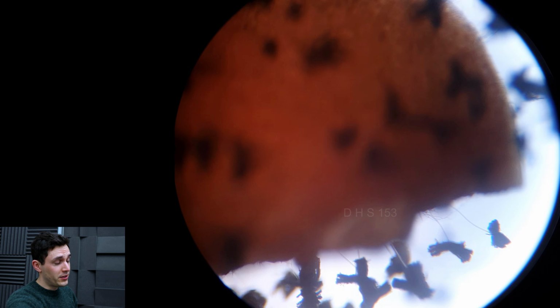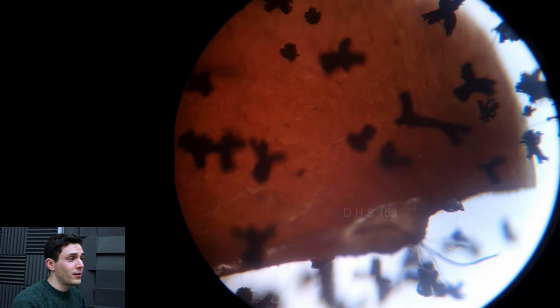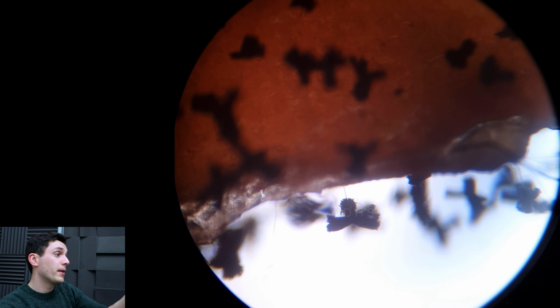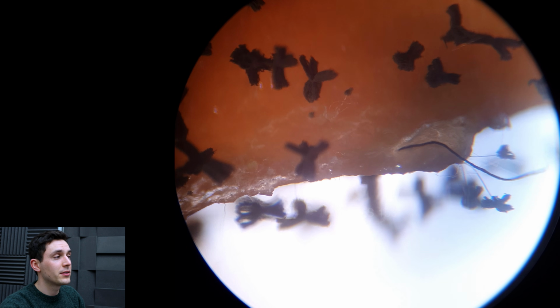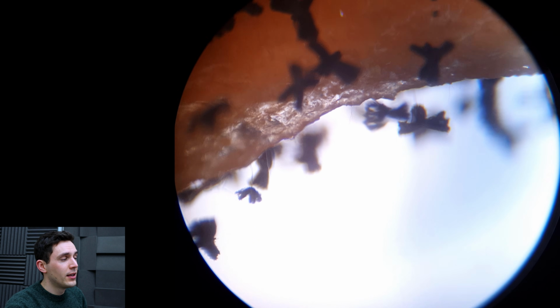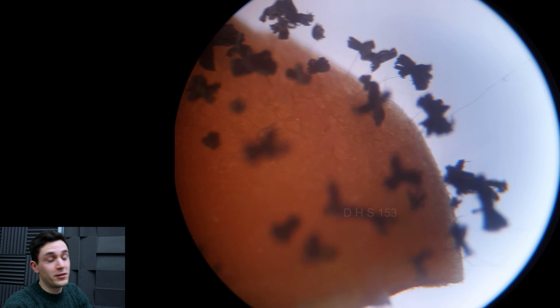It just goes to show that fungus, like Aspergillus niger or any species of Aspergillus, is incredibly efficient at spreading and proliferating. That little black splodge of the infected earwax, I left in the test tube for ages, and I mean months. It's only when I remembered, I should probably do something with this, that I looked at it and thought, I'll feed it some apple. And of course, it's colonized on that.